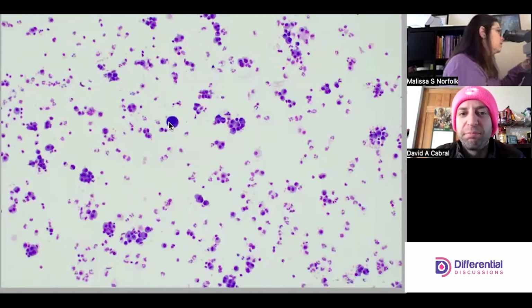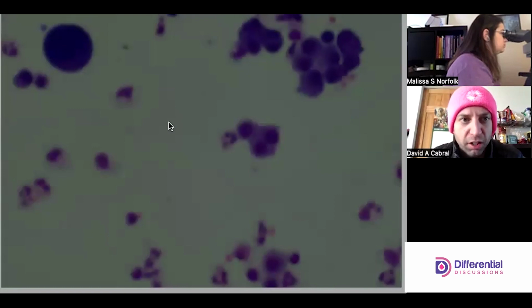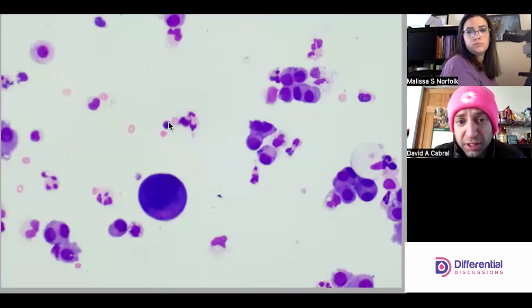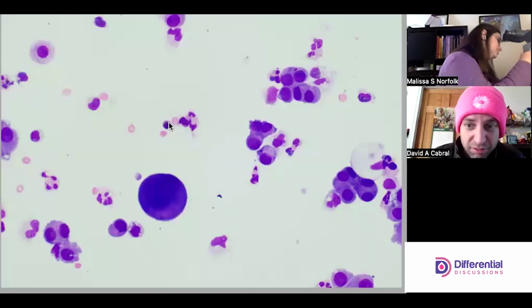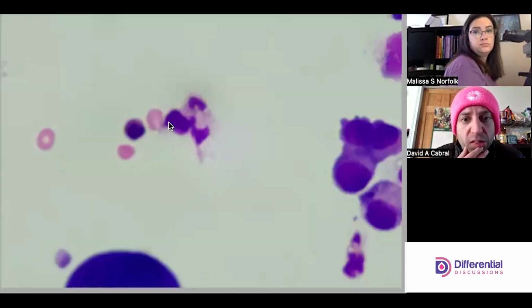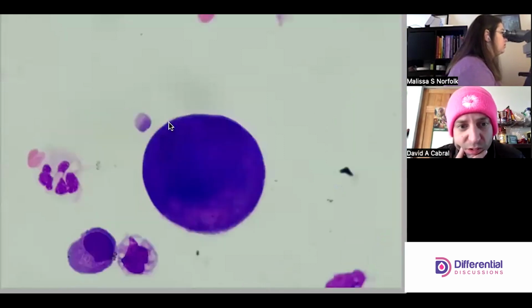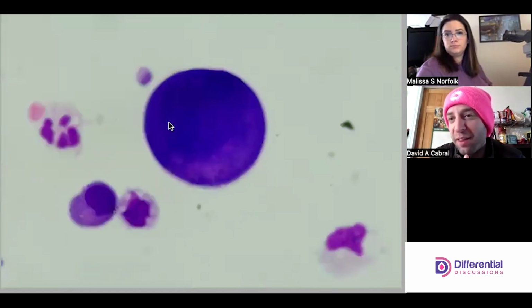I'm going to drop down. So in terms of normal physiology for big dark cells like this, you can definitely have, in inflammatory conditions, a reactive mesothelial type picture. Yikes, I'm going down. For me, this is like Path City.